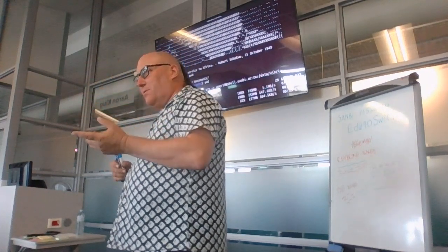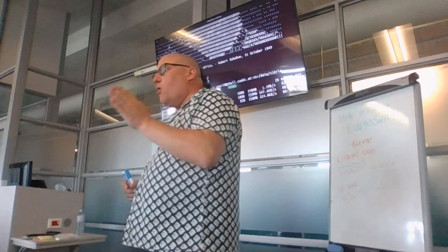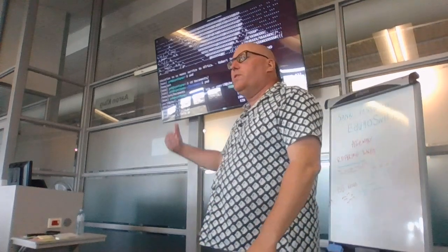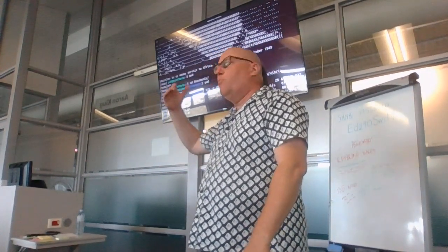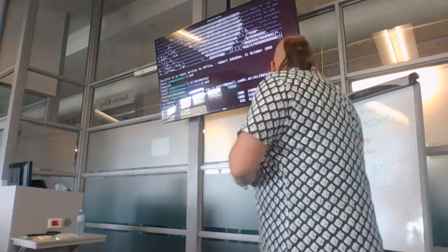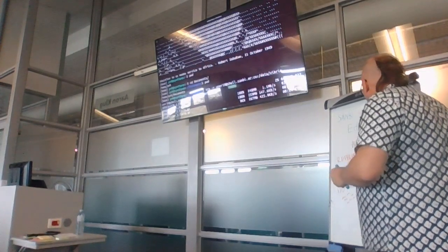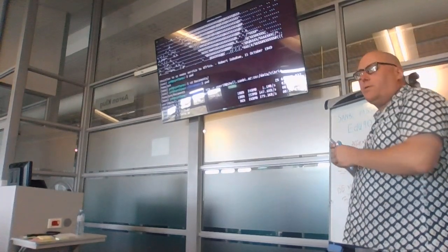It's the number of different alleles, not the number of mutations, because we don't actually know how many. We don't know, between allele 1 and allele 2 in the databases, how many mutations there are. There could be 5, there could be 2, there could be 1. So the difference here is the number of alleles different, which here is 1, okay? This is 1 allele, because these are all the same except for 1.